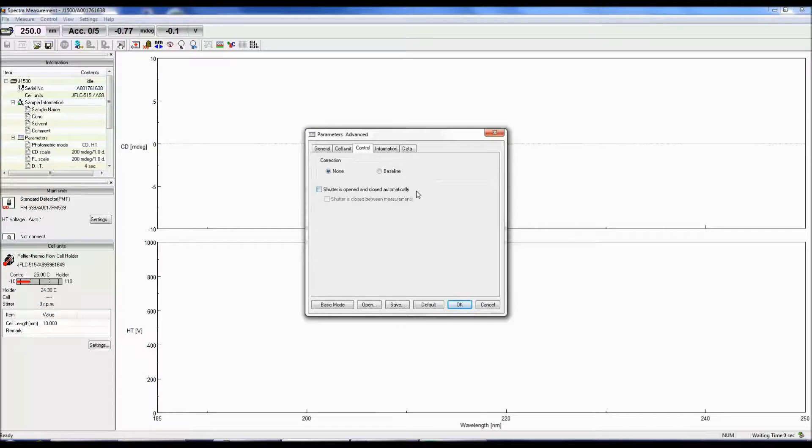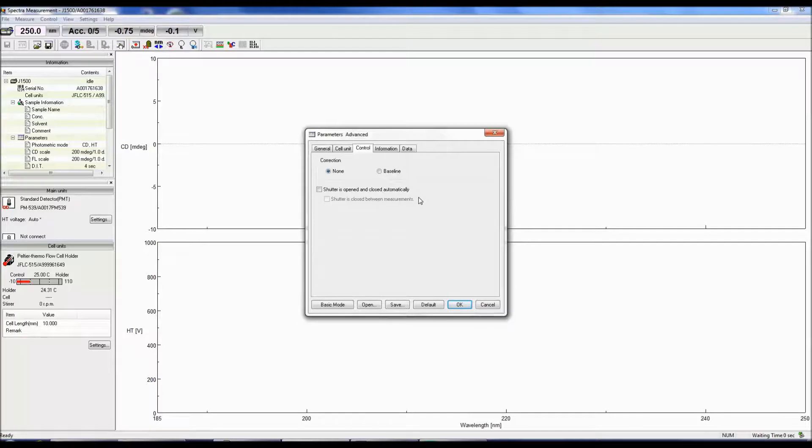You can also choose to open and close the shutter automatically or close the shutter in between measurements so that the sample will not be irradiated when a measurement is not being obtained.